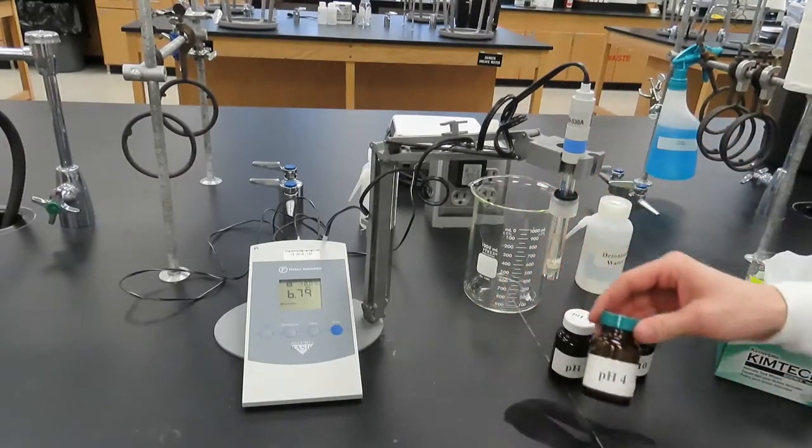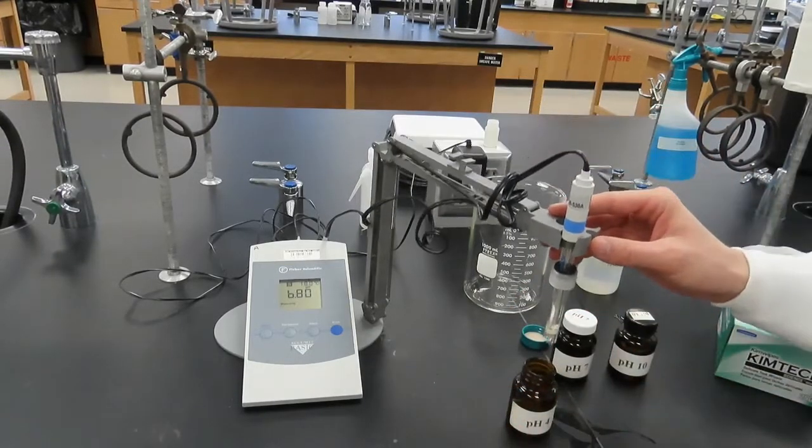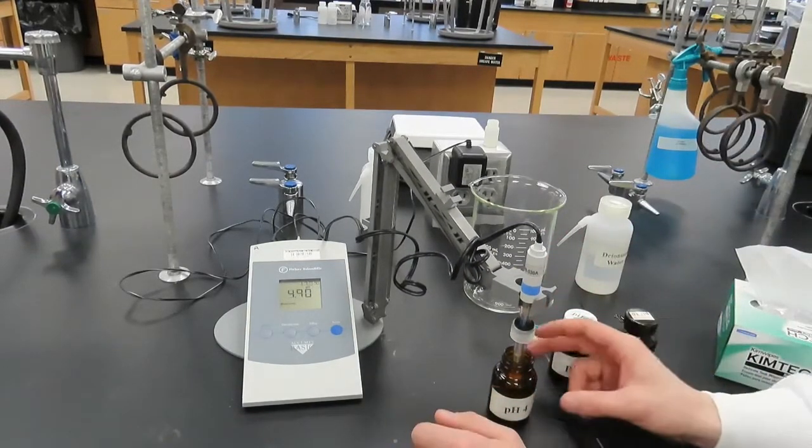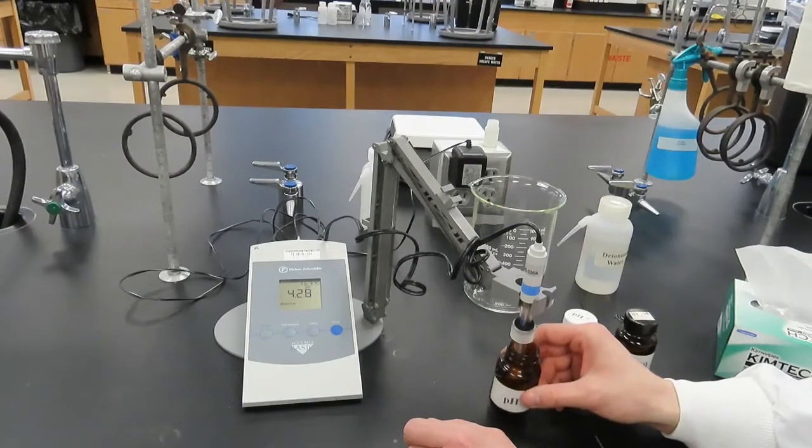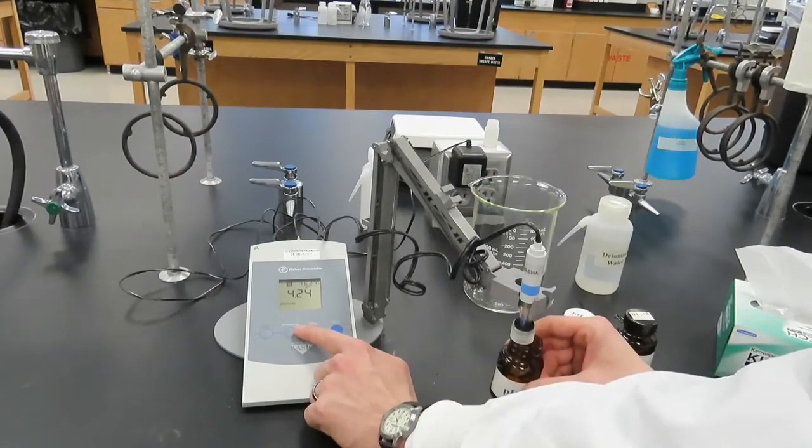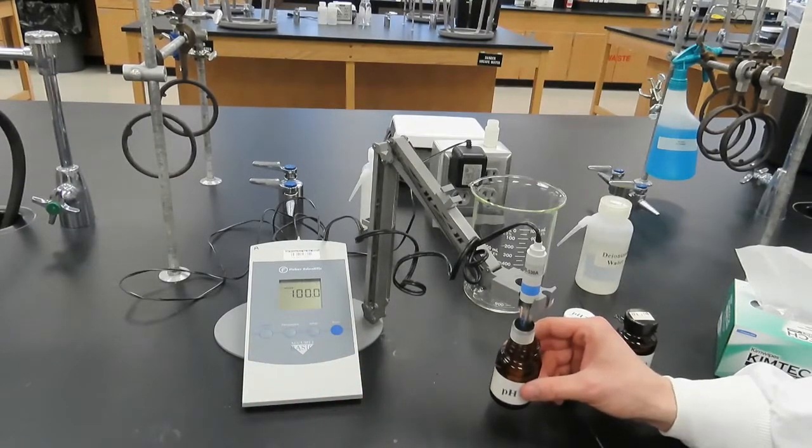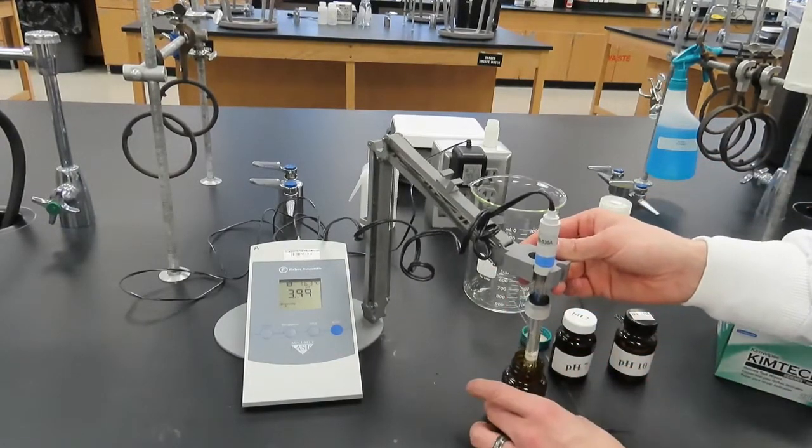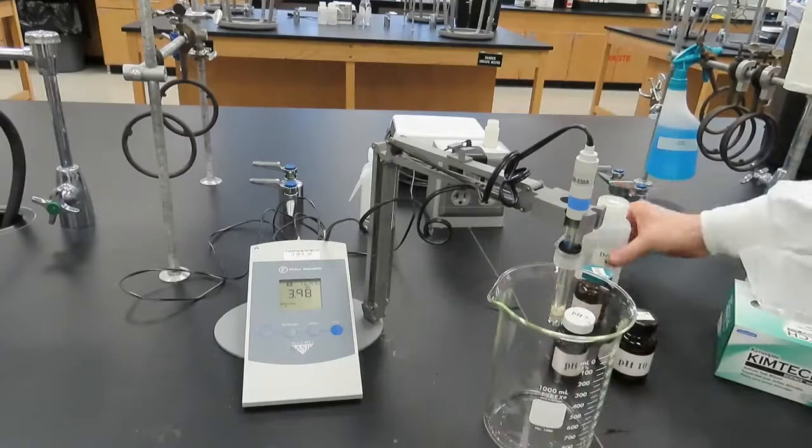To calibrate, we will first use a buffer solution of pH 4. Ensure the bottom of the electrode is fully immersed in the solution and swirl the solution. When the pH value in the display stabilizes, press the Standardize button while continuing to swirl the pH 4 buffer solution. Remove the electrode from the pH 4 buffer solution, rinse, and dry it.